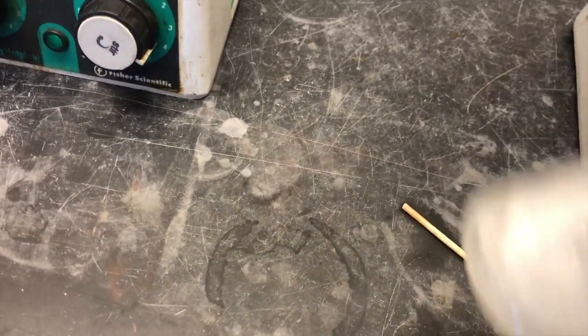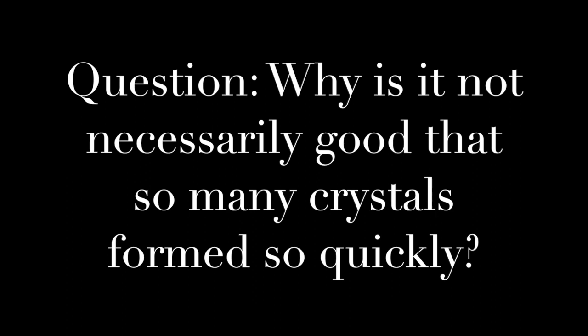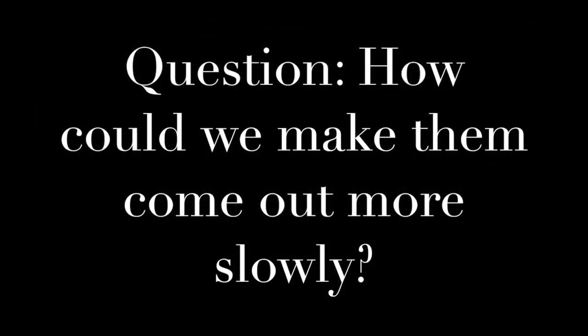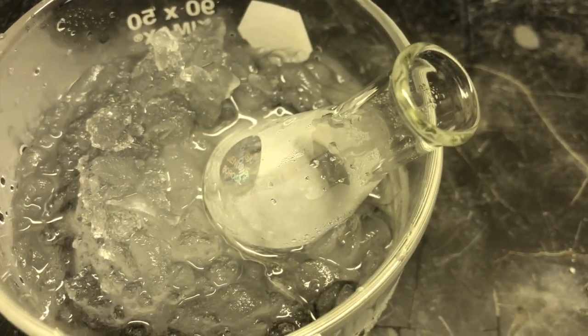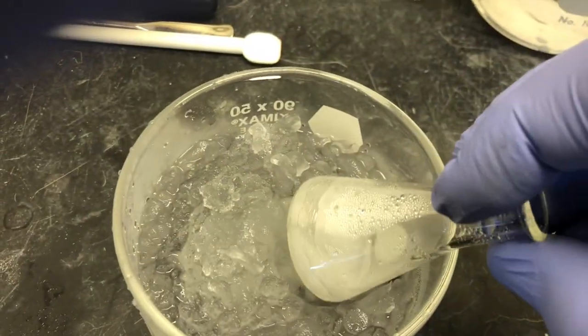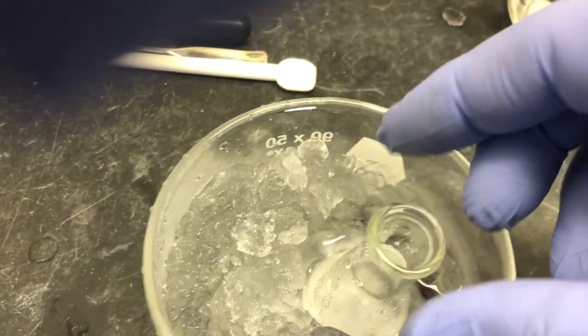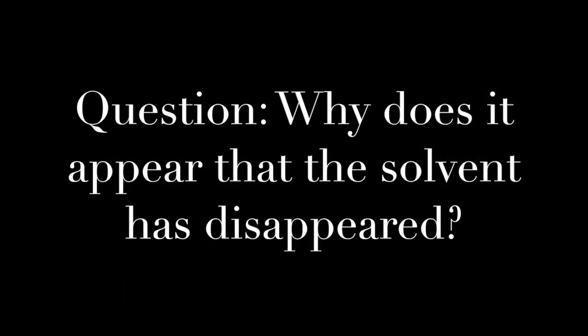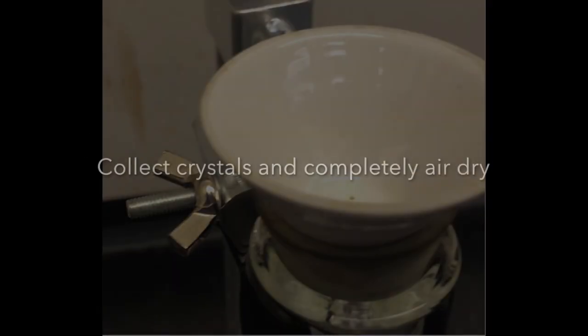We continue to let the solution cool and crystallize on the bench top, and once it is close to room temperature we can then place it in the ice bath. Once in the ice bath the crystals will continue to form and we will be able to maximize our yield by lowering the temperature of the solution. You can see how many crystals have formed in the solution at this point. We collect the crystals by vacuum filtration, just as with the crude product, and then let the crystals thoroughly dry before going on to the next step.